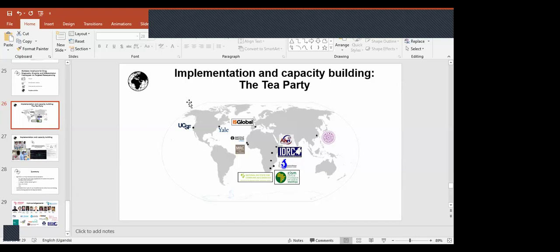Yes, so what I can say is that when we created this panel, it was mainly designed with malaria in mind, and it's based on reference genomes of P. falciparum and the other four non-falciparum species of malaria. So I think it's malaria specific. I don't think it can be applied to other vector-borne diseases yet. But could you follow a similar protocol to design something like this for one of the other parasites, in your opinion?